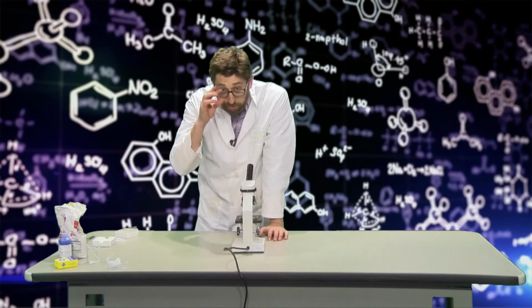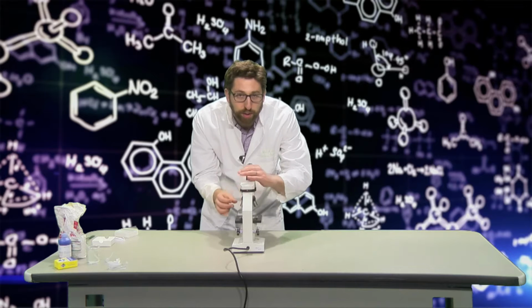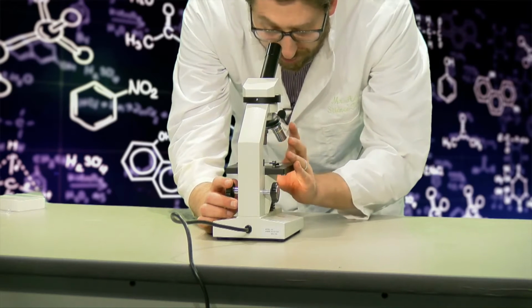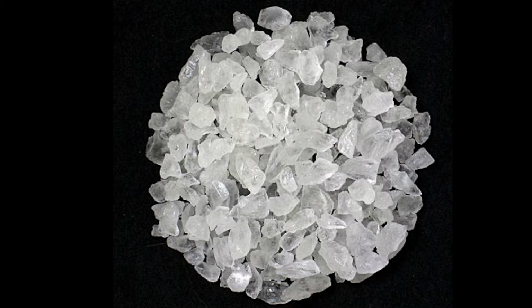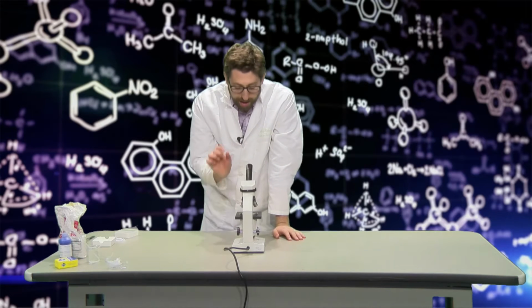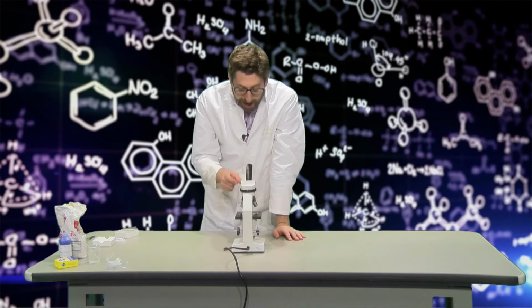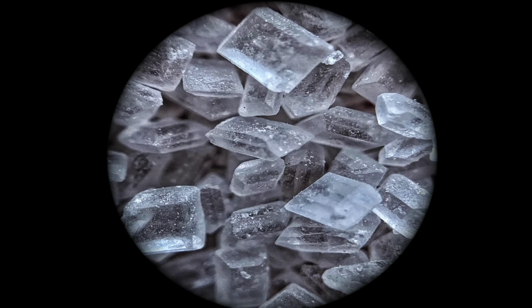I always remember to turn the light on so that I can see my sample. And I always start on that red low power. I bend down, I make sure there's enough light coming through the diaphragm, and then I zoom in until I can see my sample. Now, the cool thing about sugar is if you zoom in to this level, where it's 40 times what you can see with just your naked eye, I can actually see individual crystals of sugar. This looks kind of like crystals, like maybe diamond crystals, except they're sugar on the microscopic level.